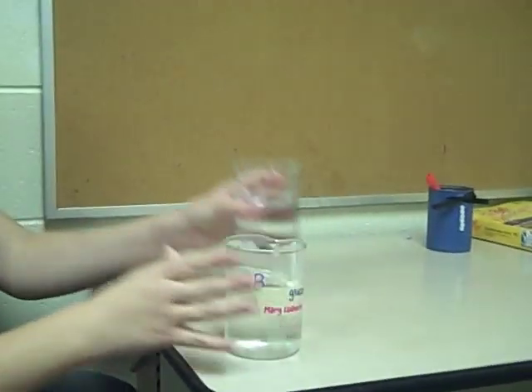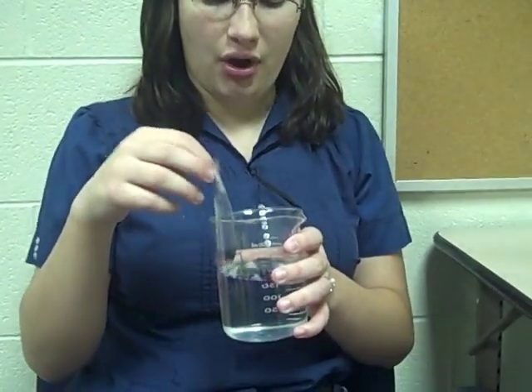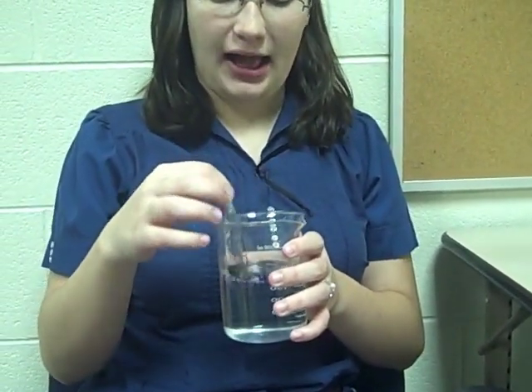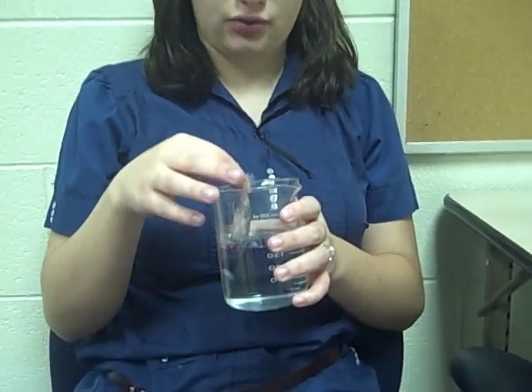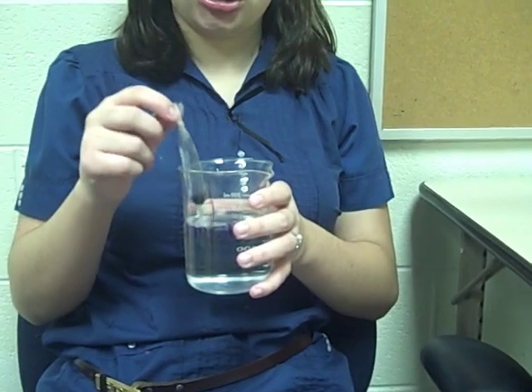Our hypothesis for starch was that if a cellulose tubing with starch solution was placed into distilled water and the iodine was added to the water, then the starch would diffuse out of the cellulose tubing and into the water.